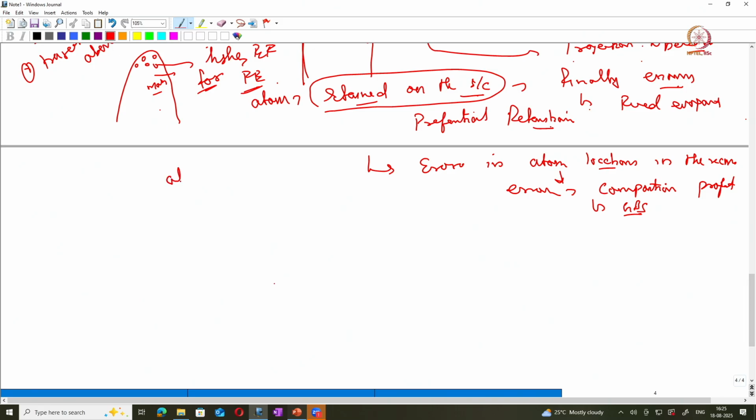If the atoms present in the needle specimen have a low evaporation field, then it will have the opposite effect.